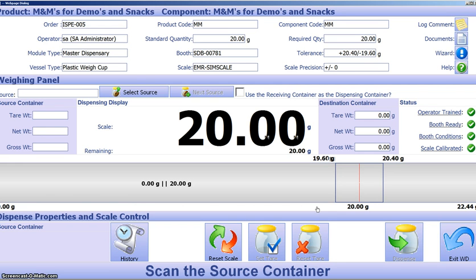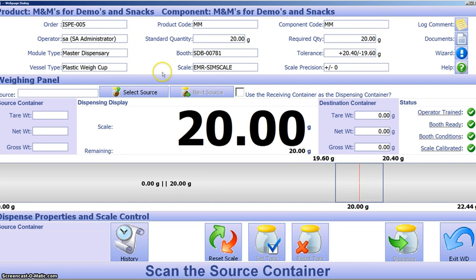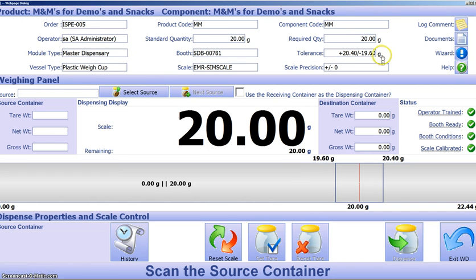And now we're moving into the full-scale system. As you can see from our video, we have a couple of sections up here. Up top, we have all the information about the order, what the order number was, where we are, what kind of vessel we're dispensing into, the products, the quantities, the tolerances.